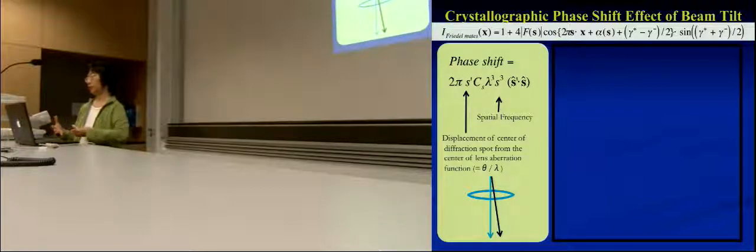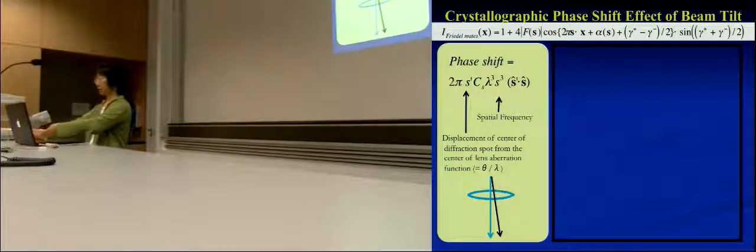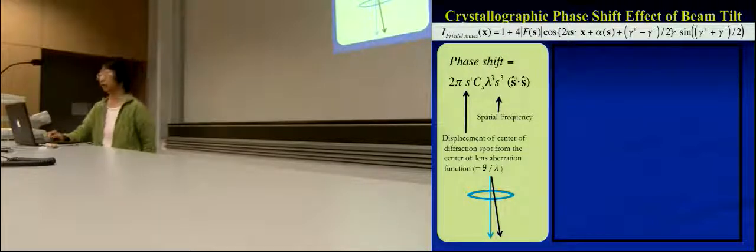And not to mention that in many cases, if you have a certain structure in one experiment, let's say we took one image today that has one beam tilt, I get a reconstruction out of my image that's been distorted. Next day I take another image which has a different beam tilt. These two structures are not going to look identical because they have the effect of the beam tilt in their phase shift. Okay, so that creates a problem when you try to merge these and get the right answer.